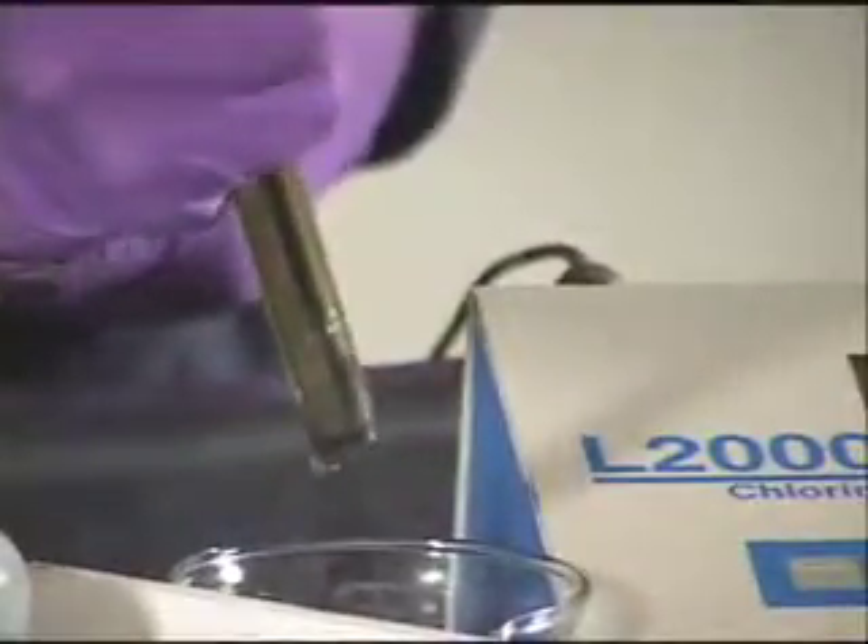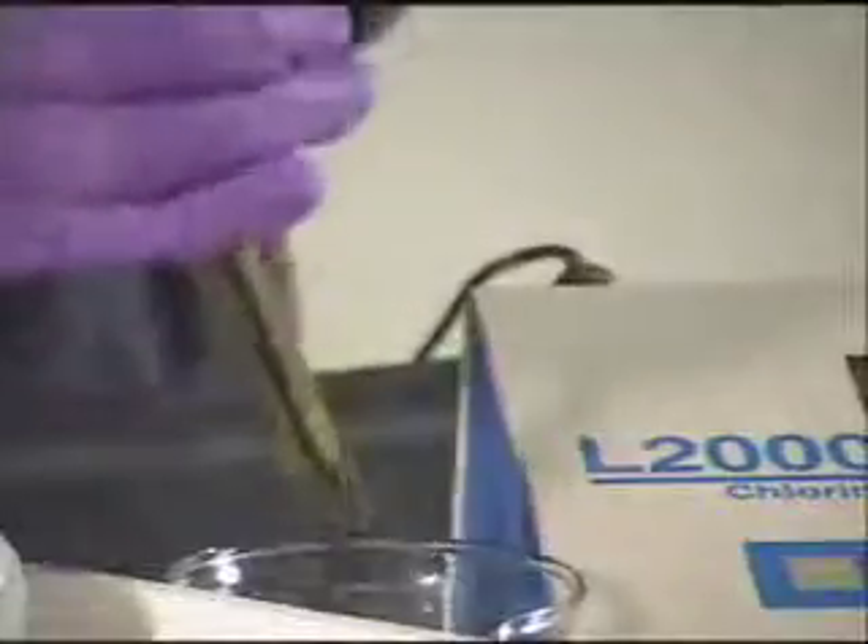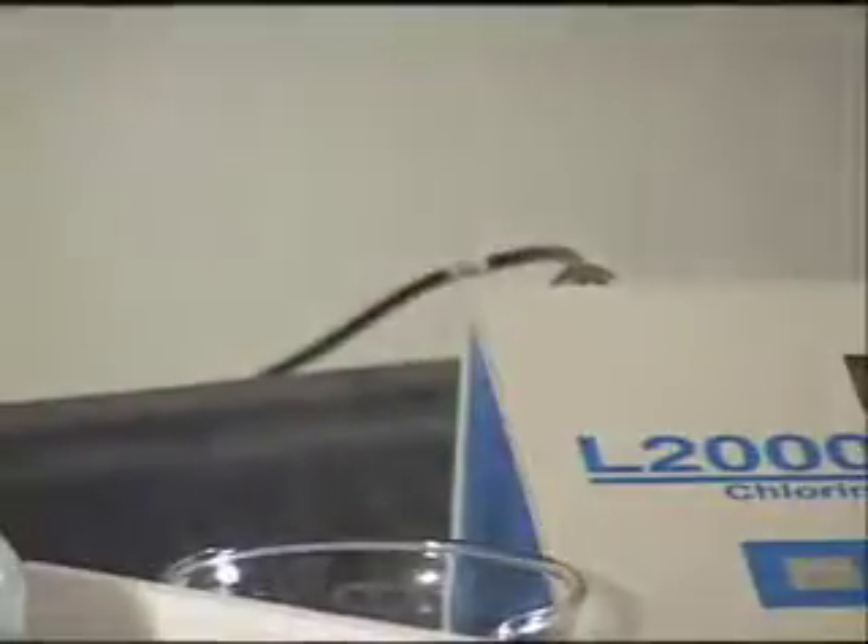Depressing the top of the electrode will release and drain the electrode filling solution from the bottom of the electrode.